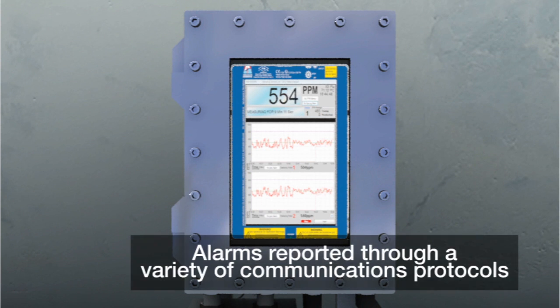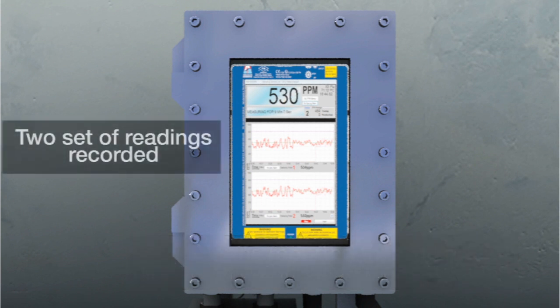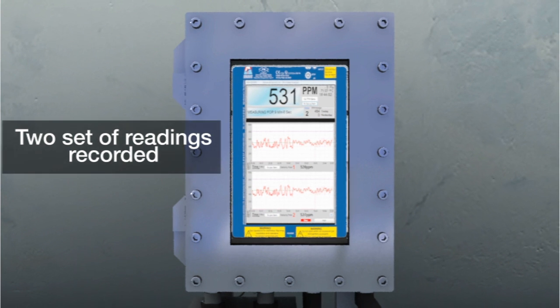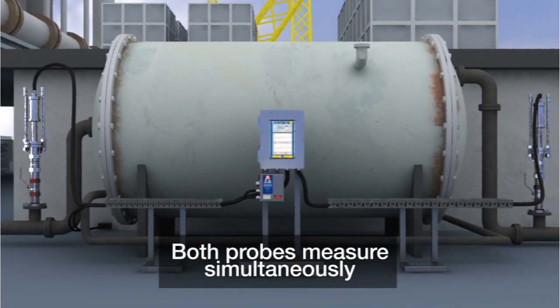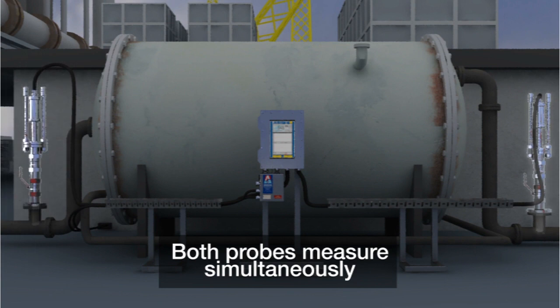Any alarms violated are reported through a variety of communications protocols. To enhance the process measurement capabilities, Advanced Sensors have developed the inline probe analyzer to measure two points simultaneously, giving true process monitoring capabilities.